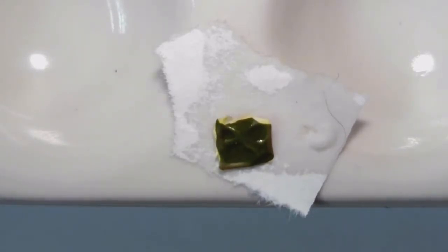Okay, and so then we can look at another specimen and do another K test. I've just got another little piece of paper here. Just using pieces of paper makes it easy for cleanup.